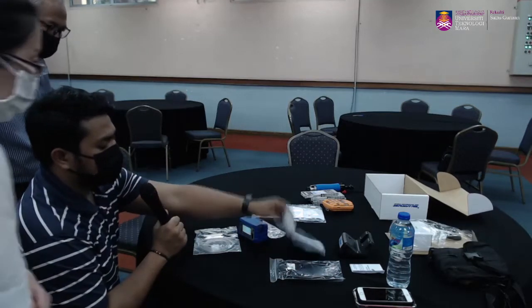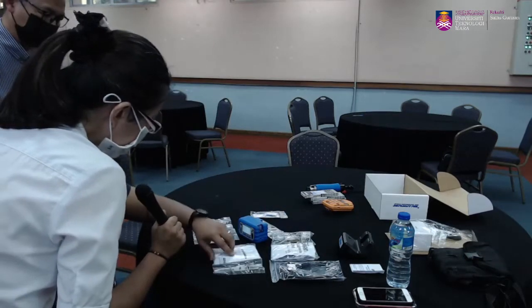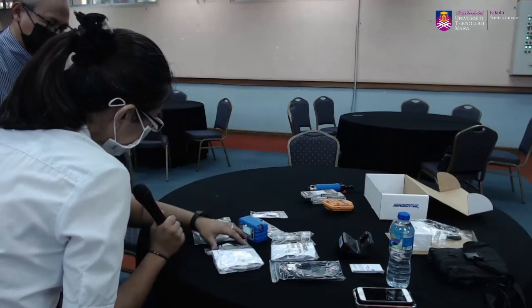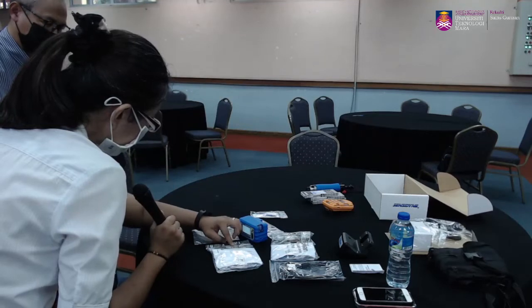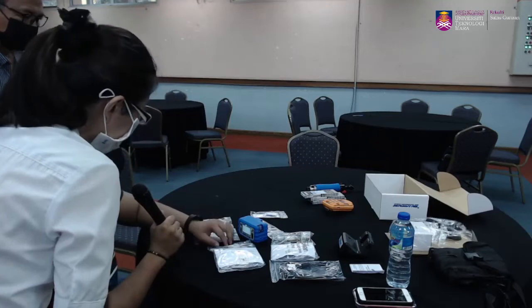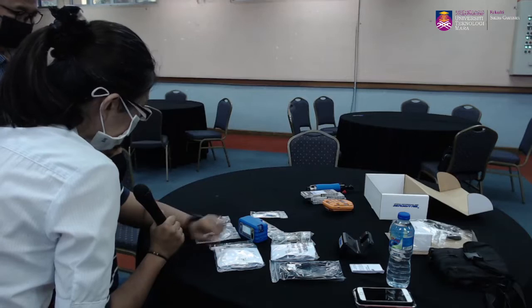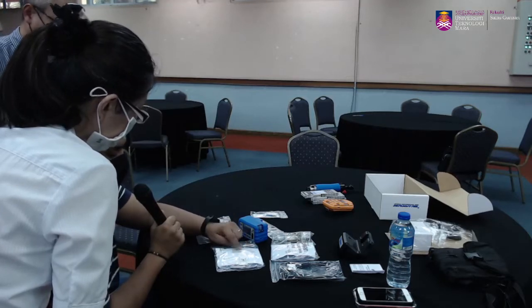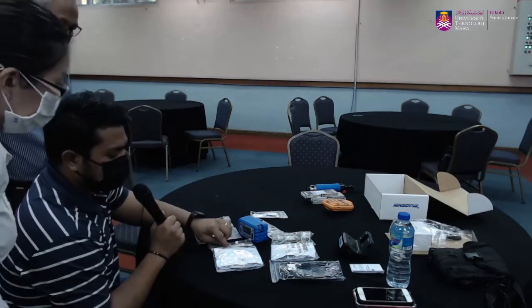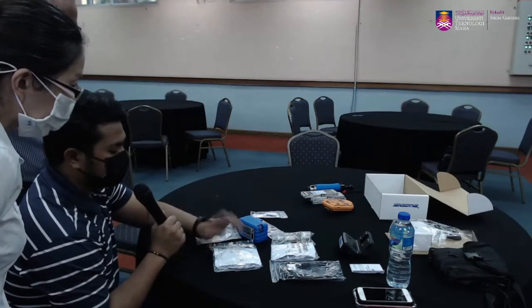And then in terms of our cassette, the tubing we use is a bit bigger compared to the charcoal tube one. So it gives us the luer connector, the luer adapter and also Tygon tubing, which are the same, but the size is a bit bigger. From this, there is an instructional diagram here. We can connect our Tygon tubing as per the picture. And the luer fitting at the top here, the clear one, we need to insert into the cassette. From there, we can connect to the cassette.